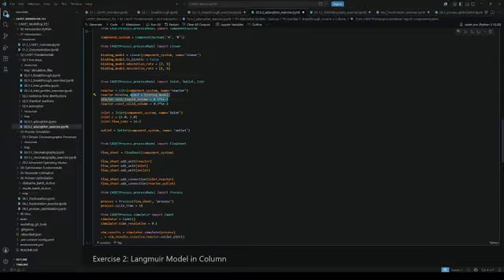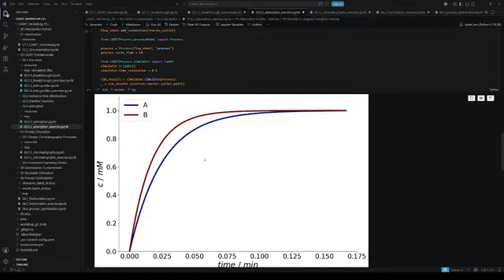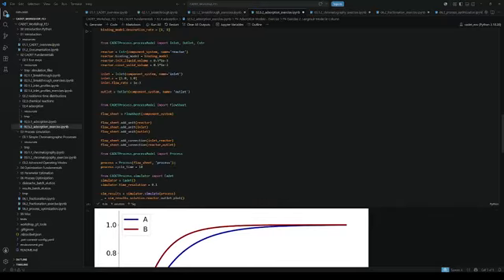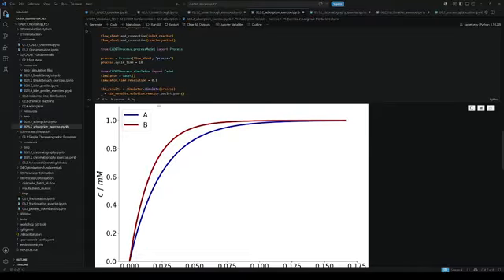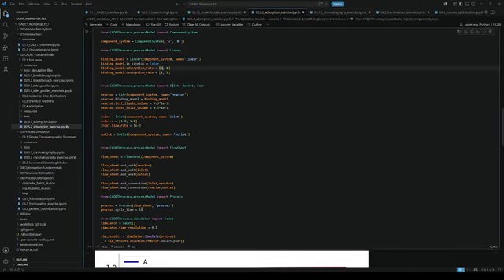Setting up the rest of the system, again, we choose a CSTR, all as before, and plot the breakthrough through the CSTR, and you can now see that component B comes out earlier out of our system, or component B breaks through stronger or earlier than component A, and this is because component A obviously is binding more to our solid phase, therefore it's less available in the liquid phase for the breakthrough.